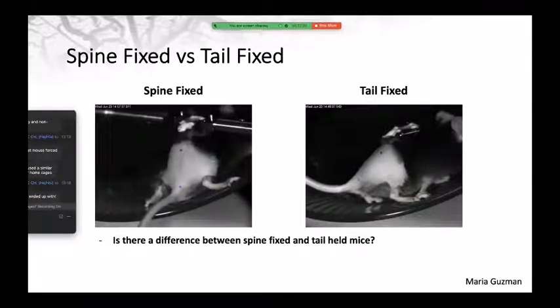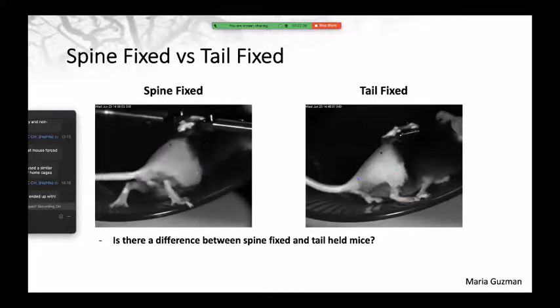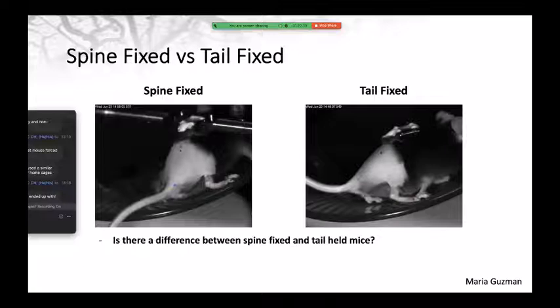So the new training paradigm was that we had to do the same implanting, wait 5 to 7 days for the mouse to heal up, and once the mouse was back in the home cage, we put the flying saucer treadmill into the home cage, and they're trained on the flying saucer treadmill underneath the microscope for 3 to 4 days.